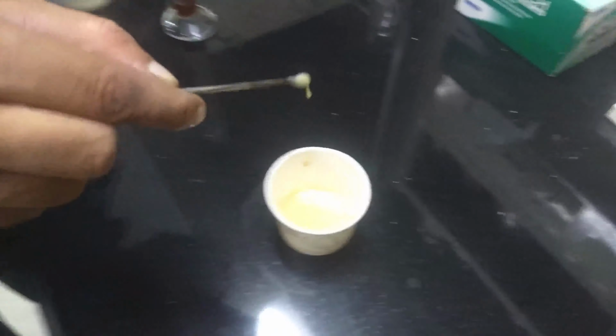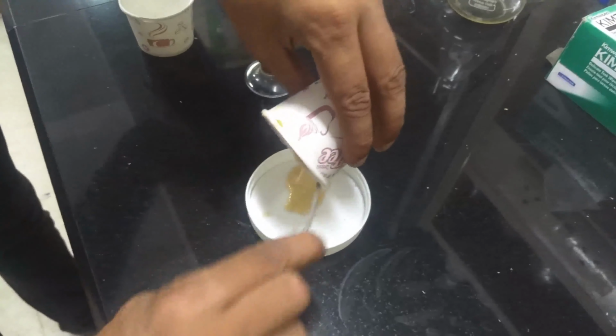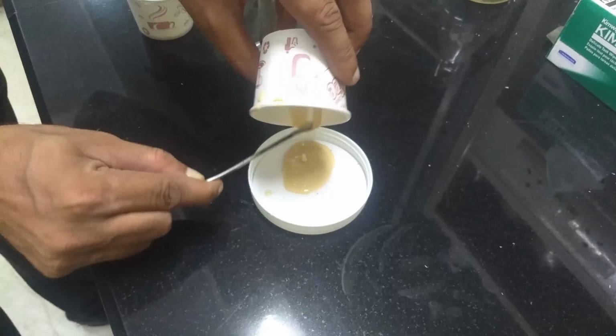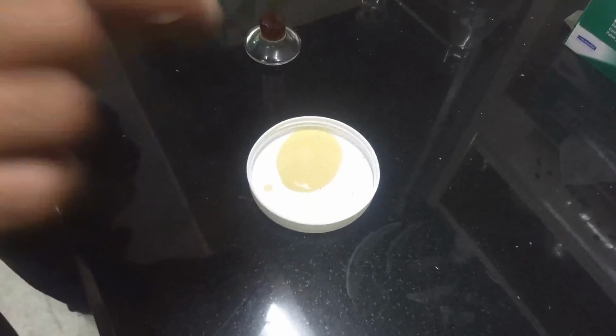On mixing properly, we have transferred the solution into a plastic dish, and within a few minutes, as we will see here, this solution will expand into a foam after 5 to 10 minutes. This is how polyurethane foam is normally made.